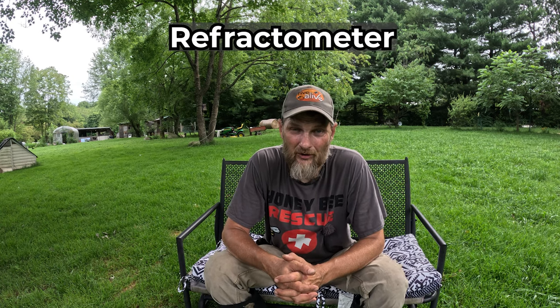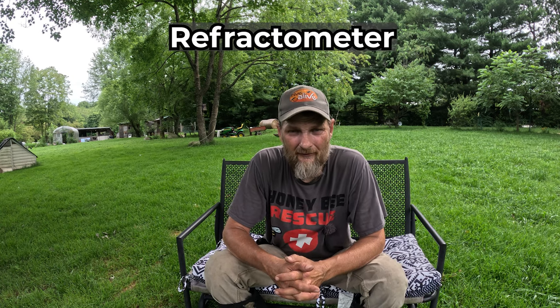You ever heard of a refractometer? That's the tool you need to check the moisture content of your honey. And in today's video, I'm going to show you how simple it is to use a refractometer.